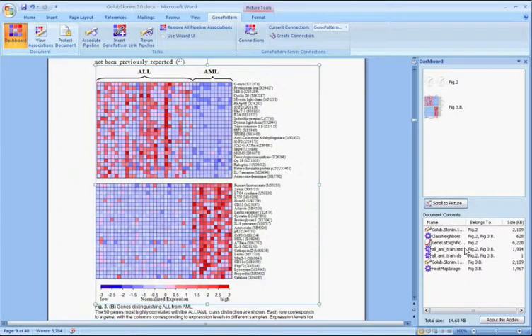This includes all pipelines, their modules, and module input files currently embedded in the document. Note that if we'd chosen to refer to the pipeline on the server, rather than storing it in this document, its contents would not be displayed here, as they would not have been embedded in the document. A thumbnail of the figure would, however, be present in the top pane, indicating the association.